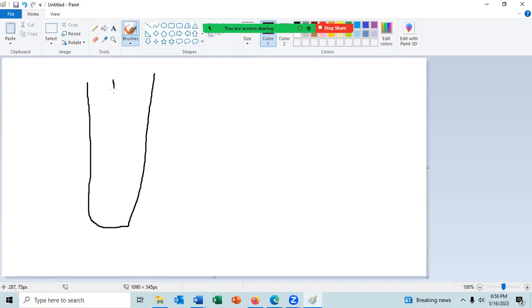And then we stab, and the bacteria will grow in the stab, but it won't grow everywhere. What it'll do is it'll flare out of the stab mark. And so you'll see something like this, trying to make a circular. My mouse isn't working too well. And occasionally it'll be the same or similar, but usually it'll be flaring out a little different on the other side.